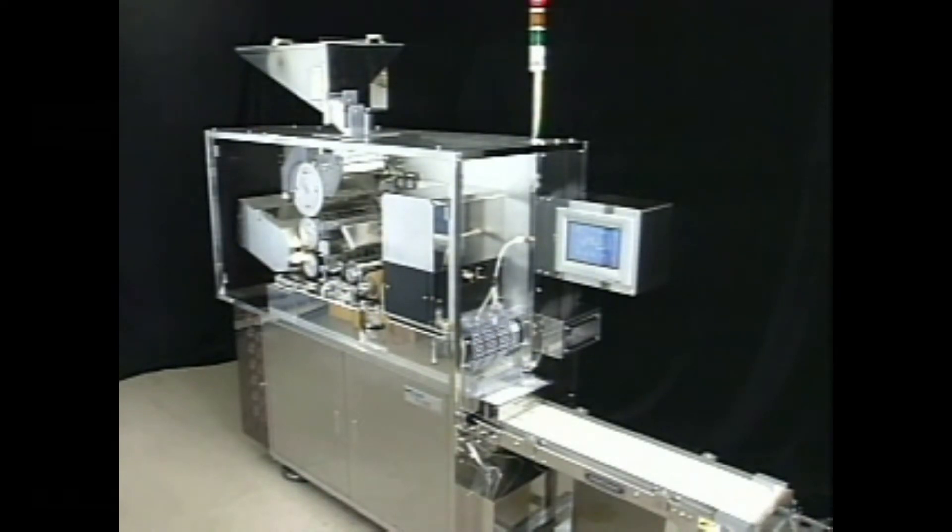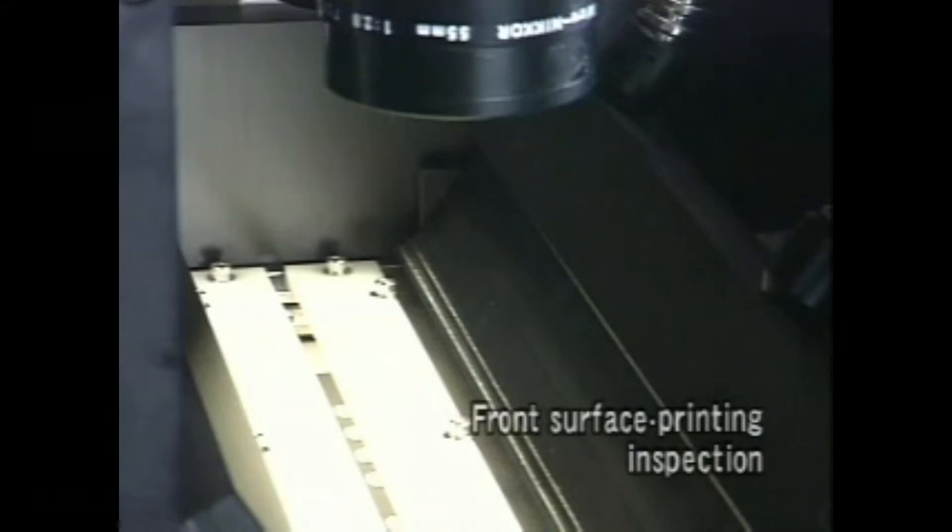After printing, inspection of the printing and the tablet surface is done at the same time. Accurate checking is performed even in a position where the printing direction is well lined up. Additionally, there is an automatic adjuster for the halogen light that plays an important role in the inspection.